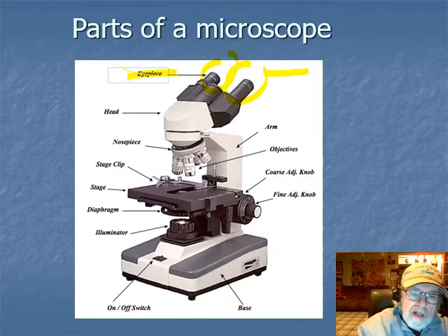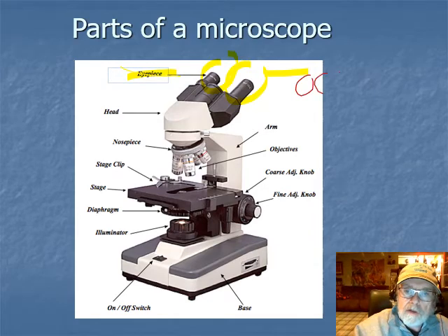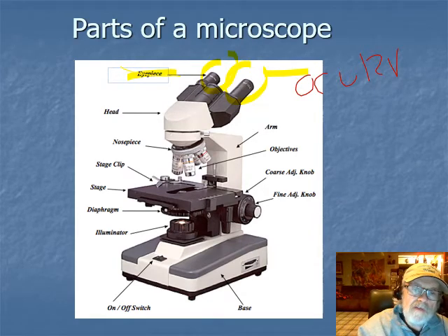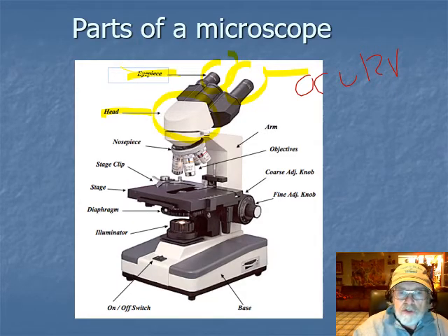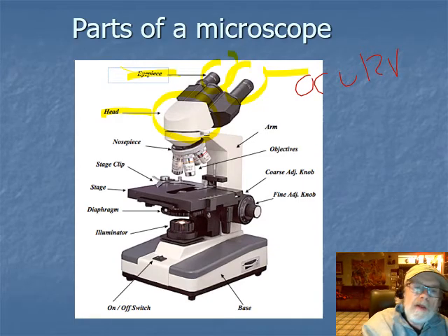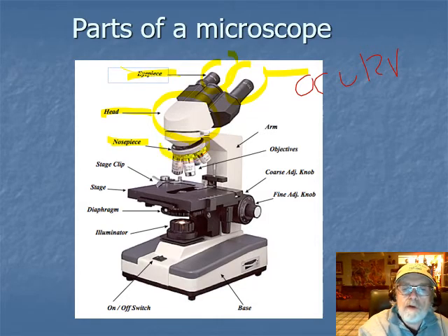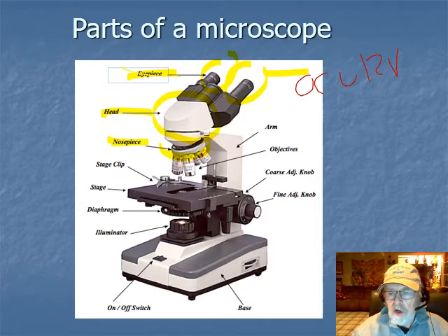Once we go down from the eyepiece, I get to what's called the head - this area right here. Below that is the nosepiece. The nosepiece revolves around and has lenses on it.